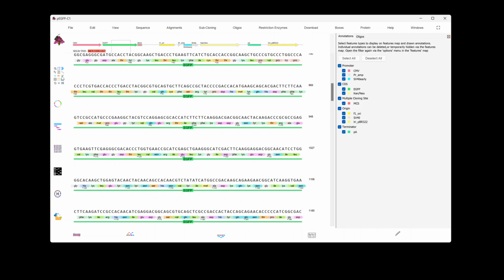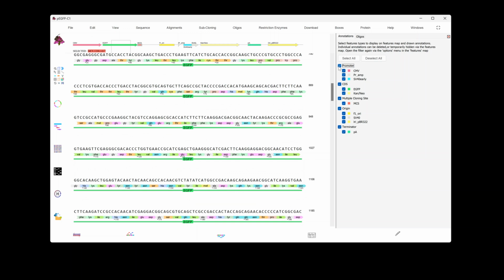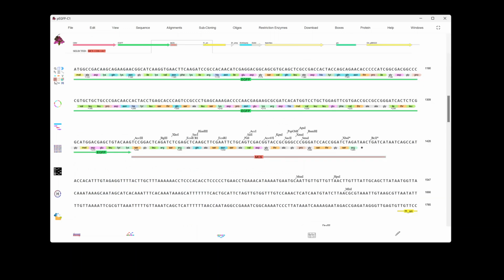The Annotation Filter button allows you to selectively hide single or groups of annotations. This can be useful if, for example, you import a heavily annotated GenBank format file and want to hide a class of annotations without deleting them. The menu shortcut lists options for the minimap. You can change the size of the text, add a scale, change the layout, or hide the map.